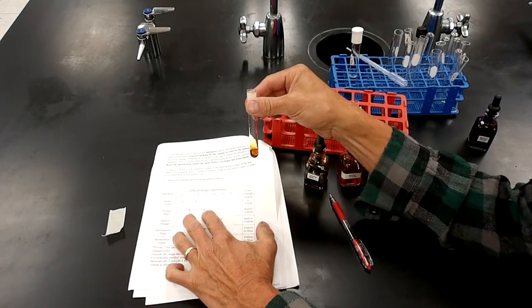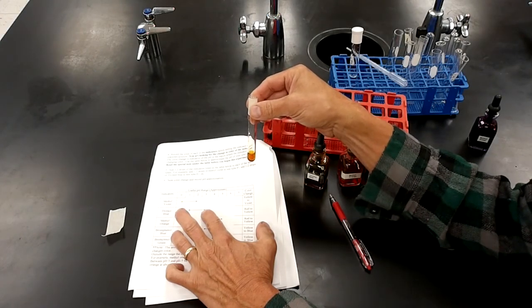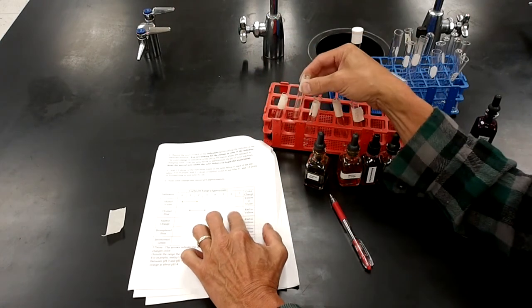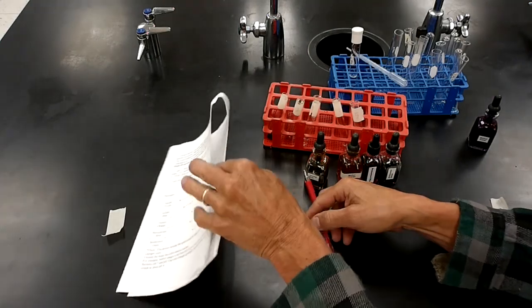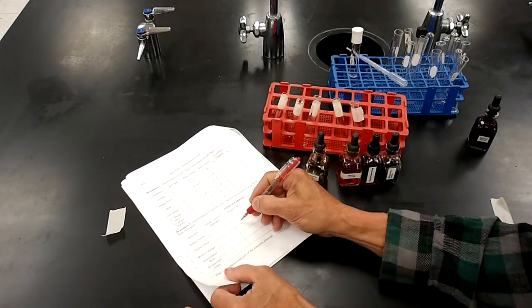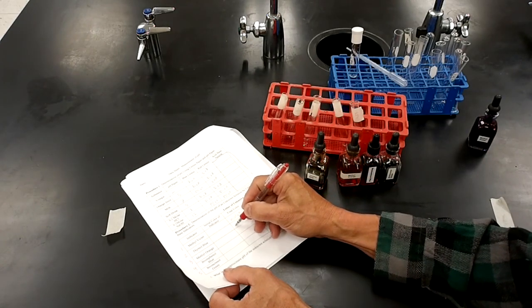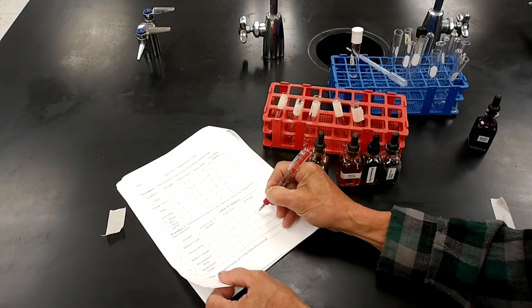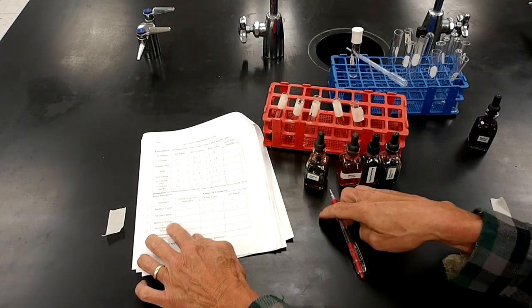I'm going to call that yellow. It's not a red. So that means it's greater than 3. About all I can say there is the pH is greater than 3. So I'll go to my data sheet. And I'm going to say this is yellow. Greater than 3. All right, I'll go to methyl orange next.